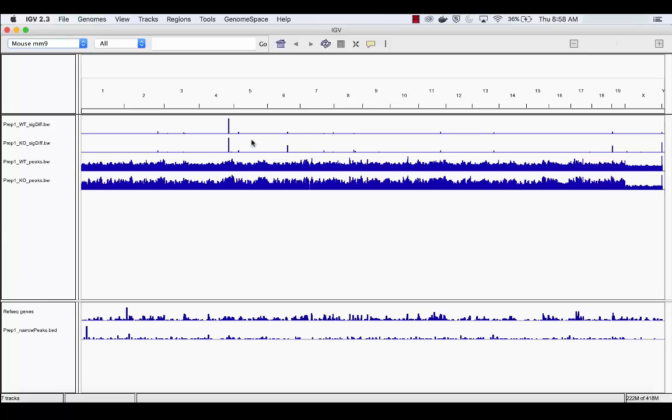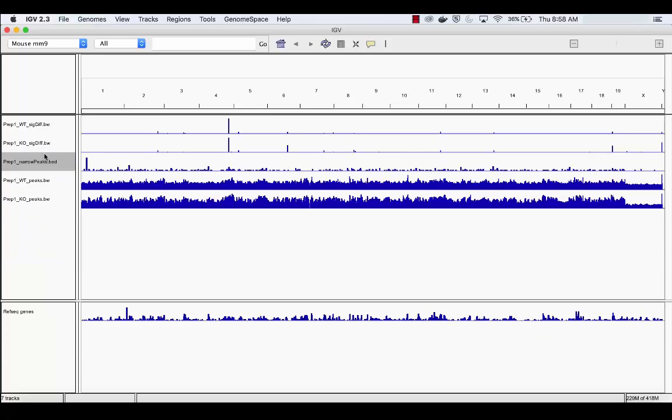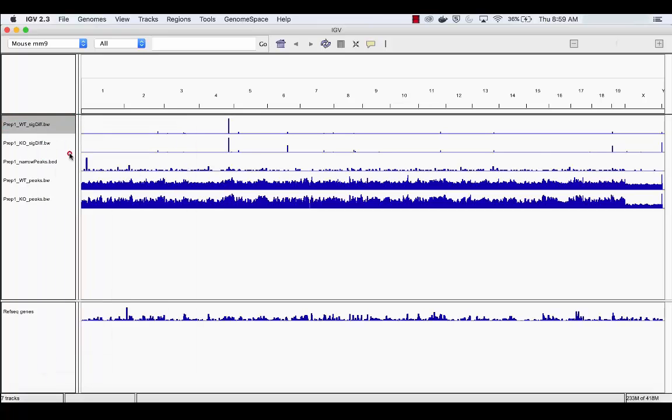Start by moving the narrow peaks track by clicking and dragging it to the third track slot. Then, change the color of the top track by right-clicking the wild-type gene expression track, selecting Change Track Color Positive, and selecting the desired color.